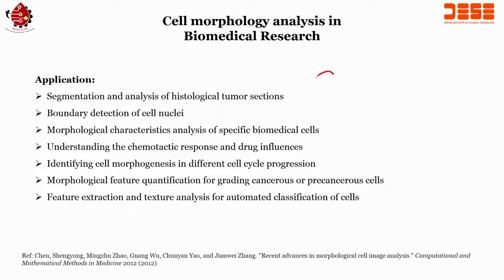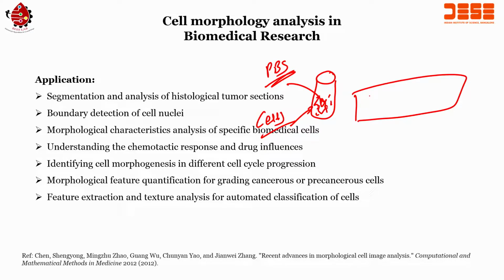When it is taken from the mouth or oral cavity, it is placed in a solution called phosphate buffer or PBS. So, there are cells in PBS. These cells, in the pathology lab, are smeared on the glass slides. So, how does the smearing work? You take the cells, put a drop here, and then take another slide and push or smear it across the bottom slide. What will happen when you do that? The cells spread like this. This is called smearing. Alright.